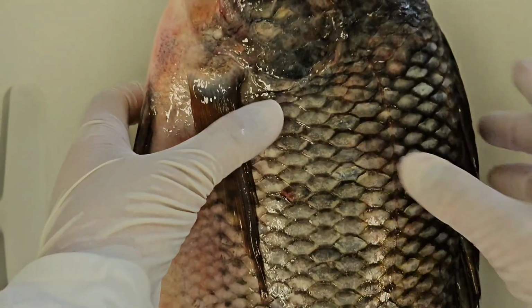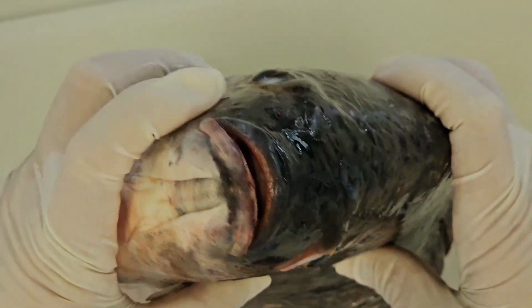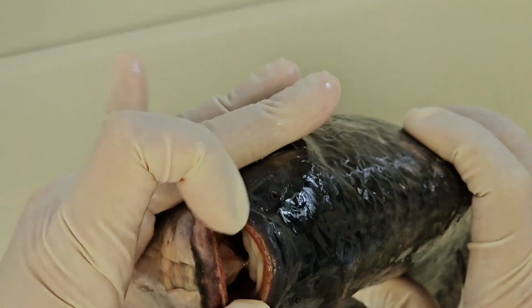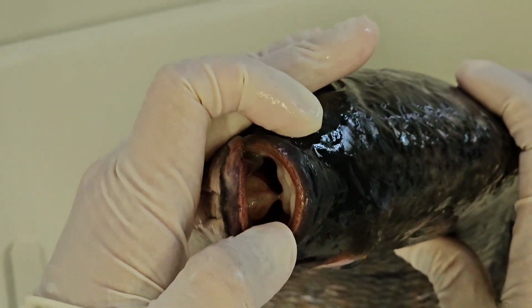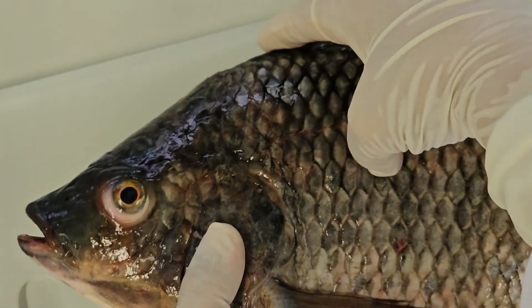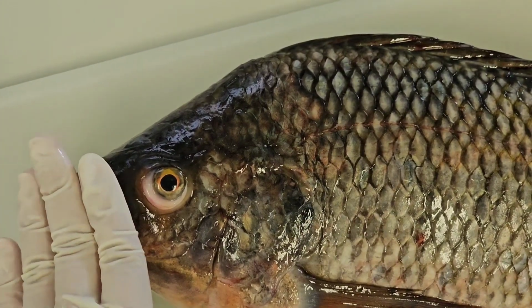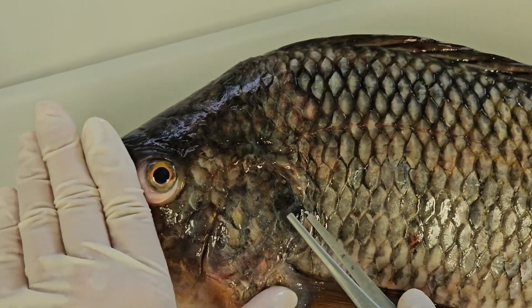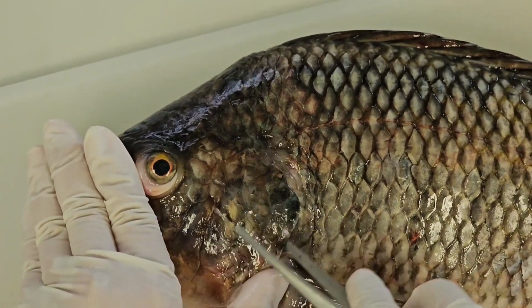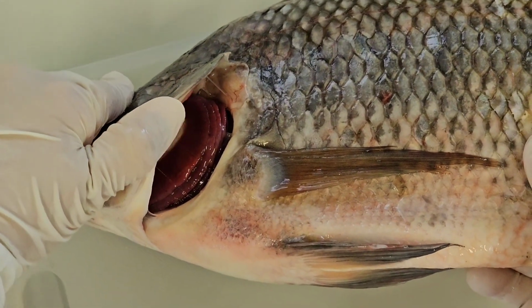And if you look at the frontal part of the body, you can see the mouth. Normally the fish has the maxilla and mandible. So if you open it, you can see the tongue inside, and it has teeth as well. Next one, you can see the operculum. If you open the operculum, underneath you can see the gills inside.